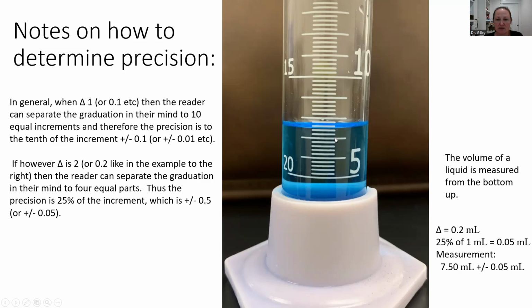Instead, it's 0.2. So 7.0 right here at the big line, then 7.2, 7.4, 7.6. And it looks like it's somewhere between 7.4 and 7.6.